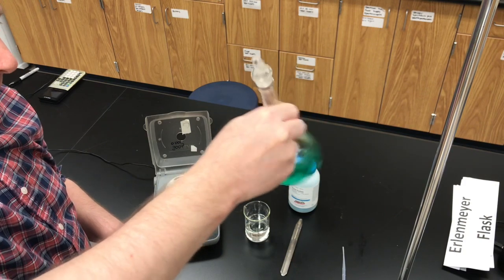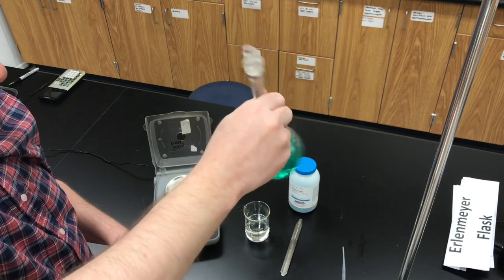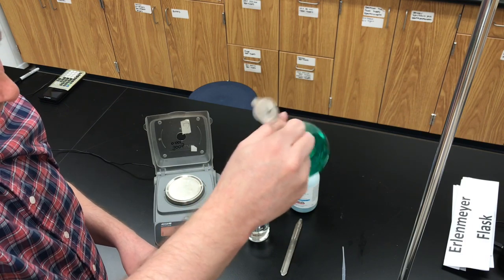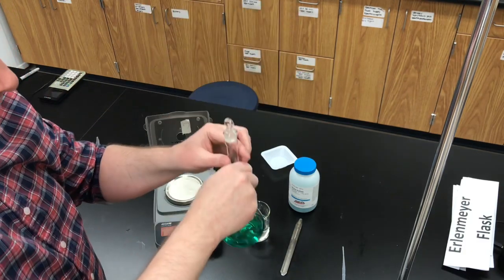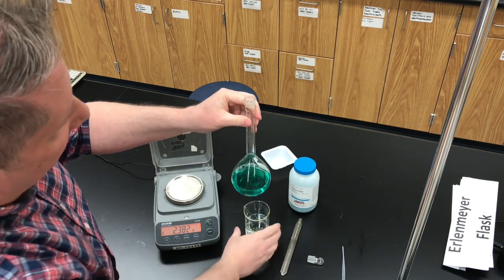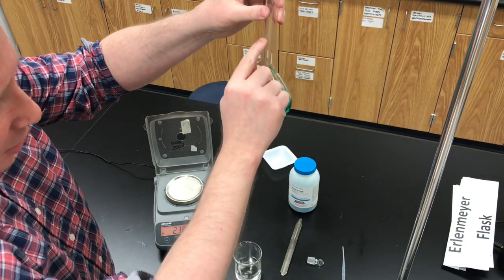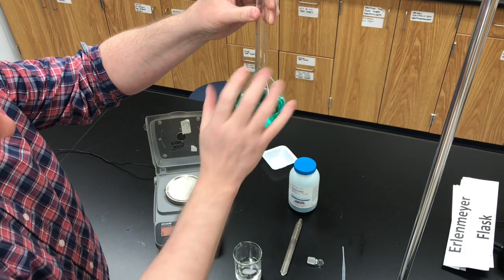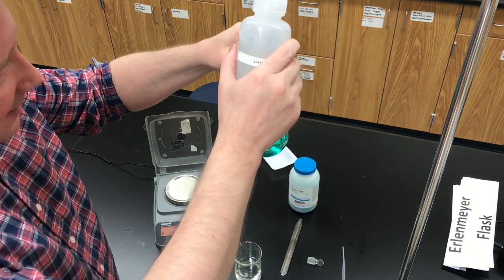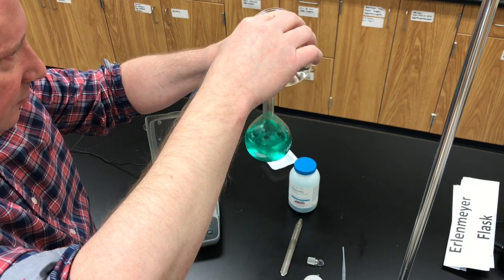Once you're convinced there's no solid salt left, take your stopper out of the flask — it should still be dry because we didn't get anything up into the neck. Now add more distilled water, but this time add it until you are just below the line on the neck of the volumetric flask. Remember, the volumetric flask has one line on it to mark the volume, up here on the neck. If you fill it up to that point, you're going to have 250 milliliters of solution. Fill it to just below that line with distilled water — don't use tap water, as tap water contains other dissolved substances.